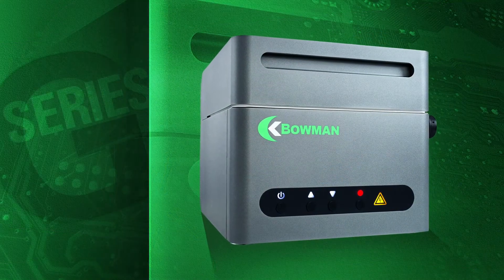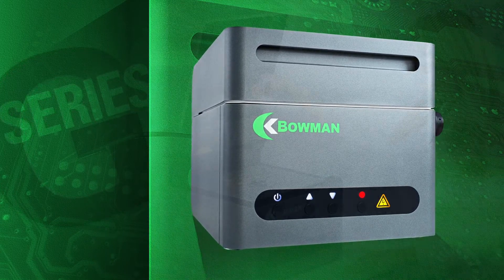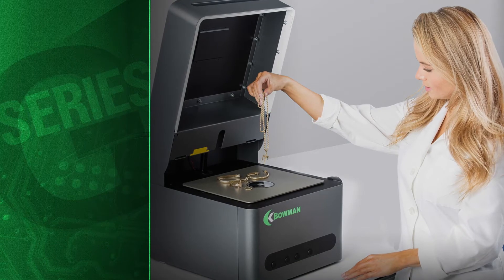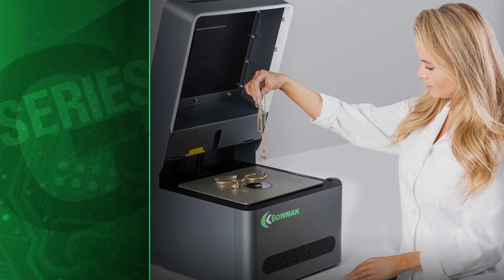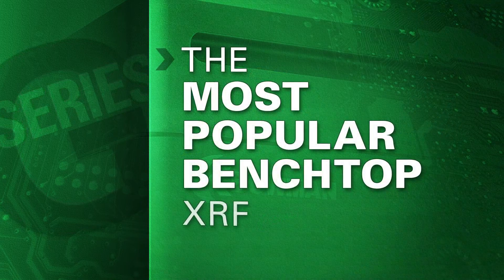XRF buyers are often surprised at the G's entry-level price. Its attractive price combined with its many features that are normally found only on more costly instruments has made the G-Series the most popular benchtop XRF, particularly for first-time users.